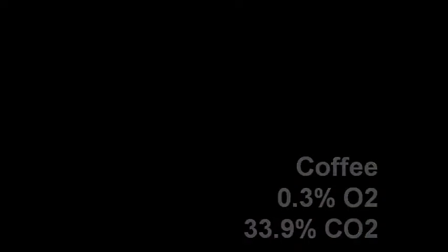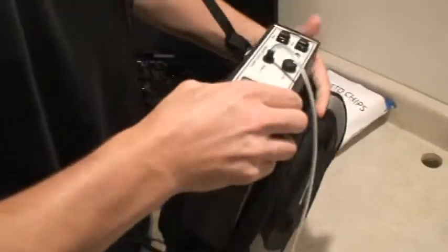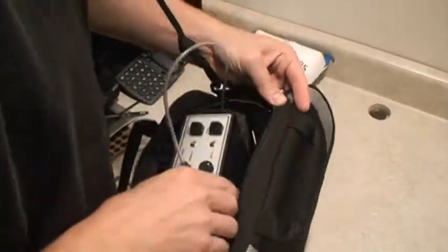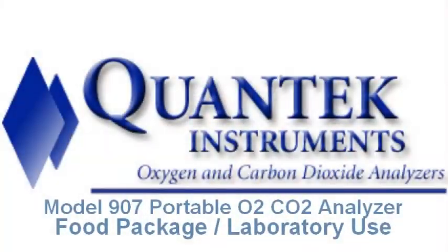Finally, we're going to package the instrument up into its nylon carry case. The tip-up feet fold back up and the analyzer is placed back in the nylon carry case. You can use it again either as a bench top unit or as a portable shoulder-carried analyzer. Please also note that this analyzer has plenty of other uses in your laboratory — any package or container can be sampled using the analyzer.